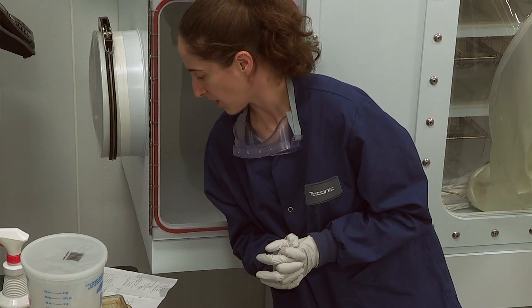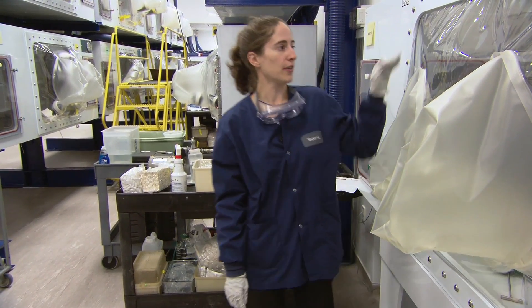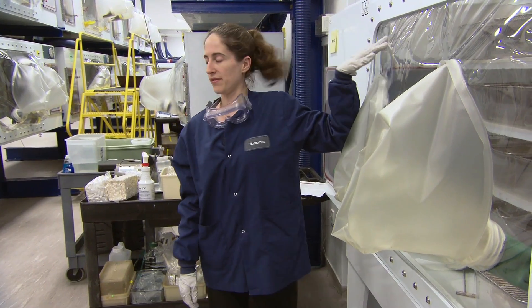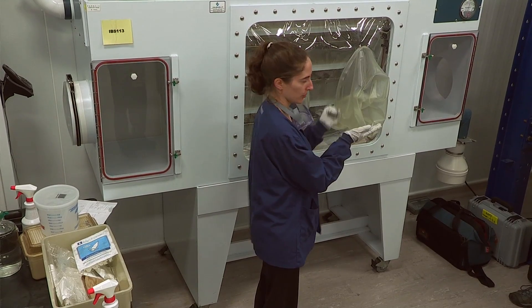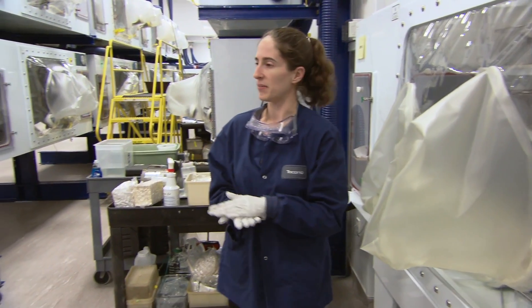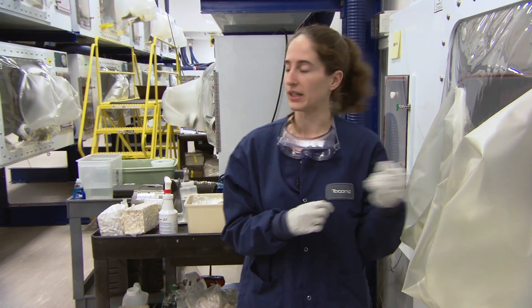The next thing I was going to talk about is isolator maintenance. When our techs are in the isolator every week, they're going through and cleaning the cages row by row, brushing off the shelves every time. Our shelves don't go flush to the back so most debris falls to the bottom. They'll take cold sterilant on a paper towel and wipe out the whole bottom of the isolator and all the shelves to make sure they're getting all the dirt out.